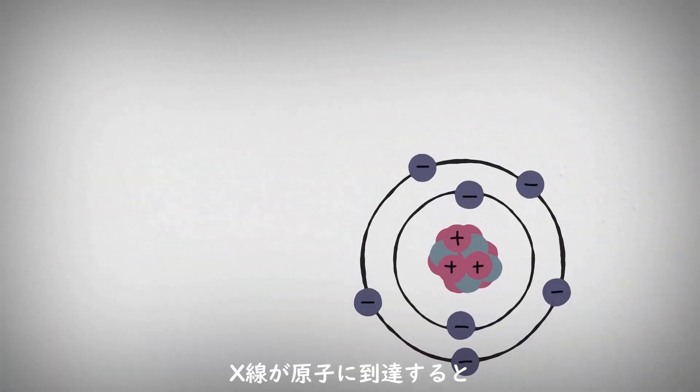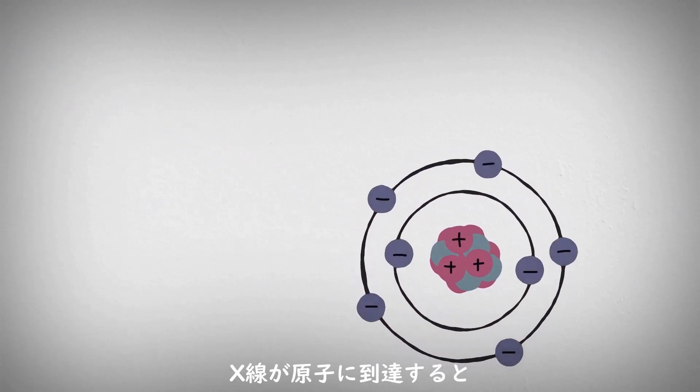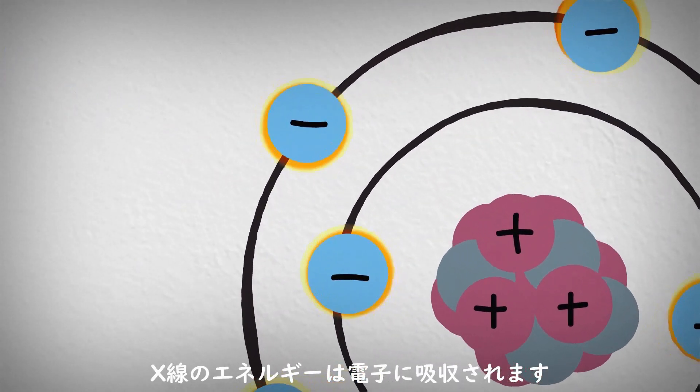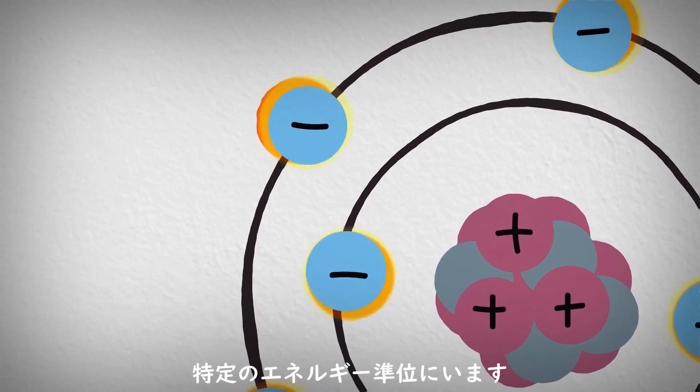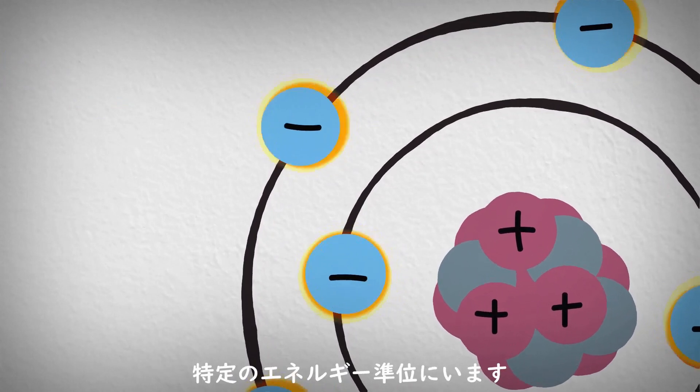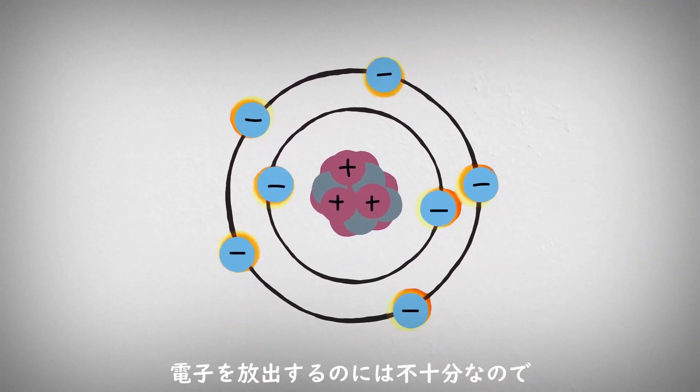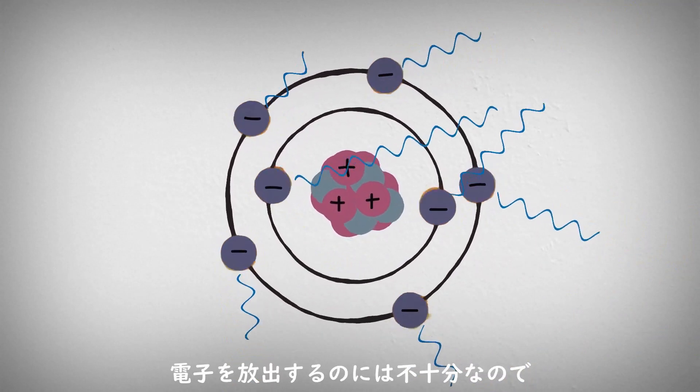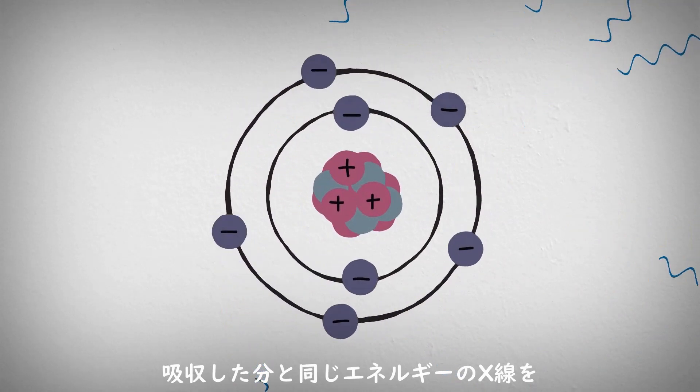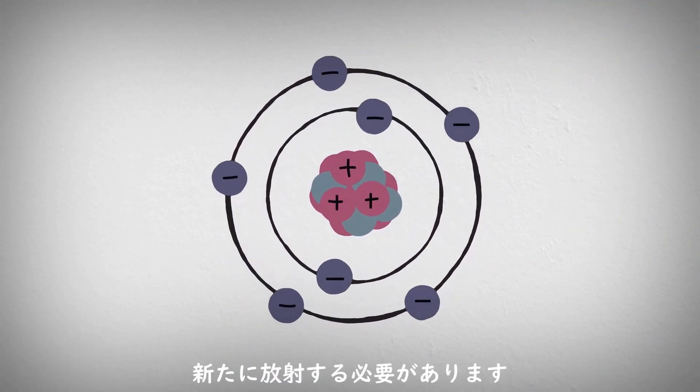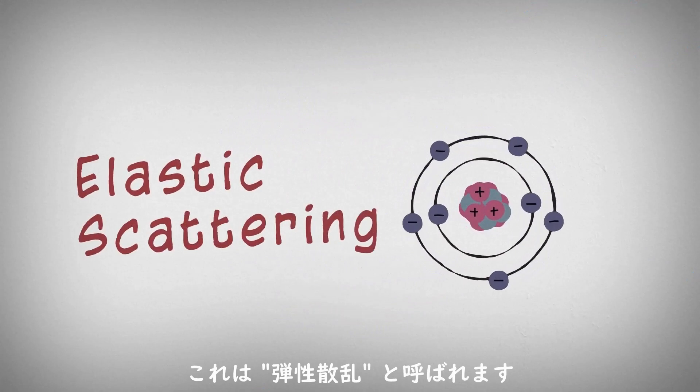When an X-ray encounters an atom, its energy is absorbed by the electrons. Electrons occupy special energy states around an atom. Since this is not enough energy for the electron to be released, the energy must be re-emitted in the form of a new X-ray with the same energy as the original. This process is called elastic scattering.